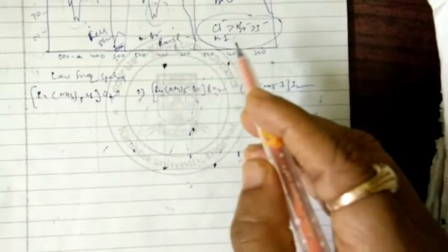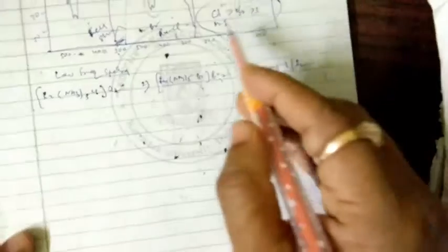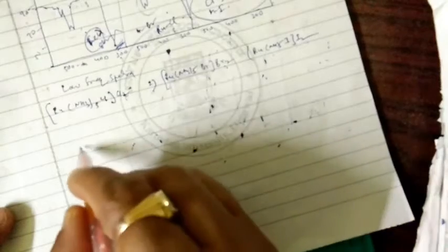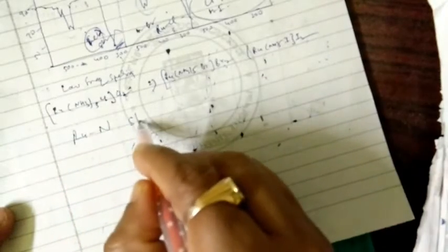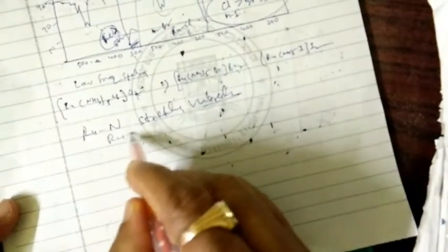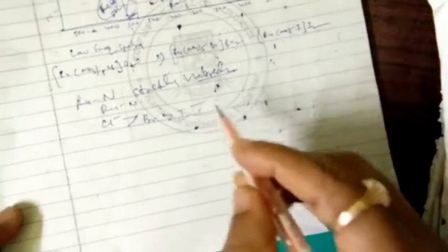So this is how we can identify the geometry also, C3v, C4v, and how the IR spectra differ for the same metal ion complex with different halides. The main thing here is the ruthenium nitrogen stretching vibrations. They decrease in the order chloride greater than bromide greater than iodide.